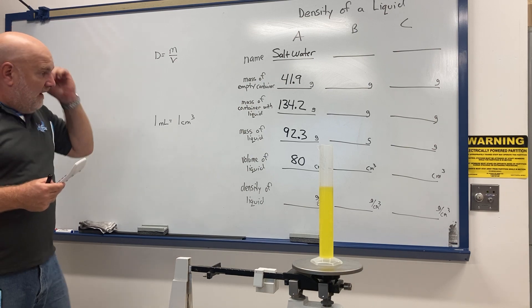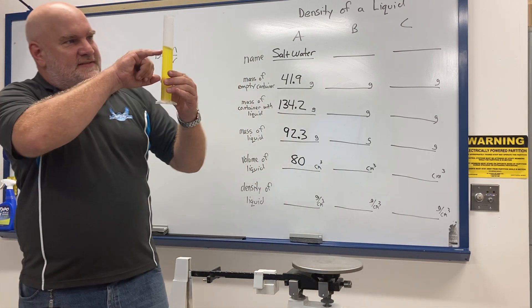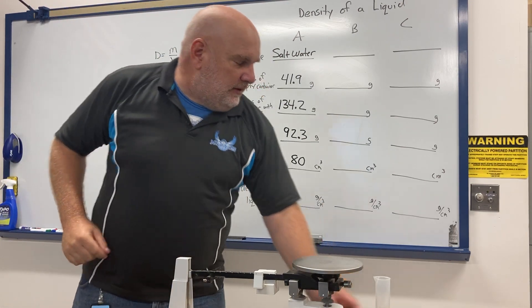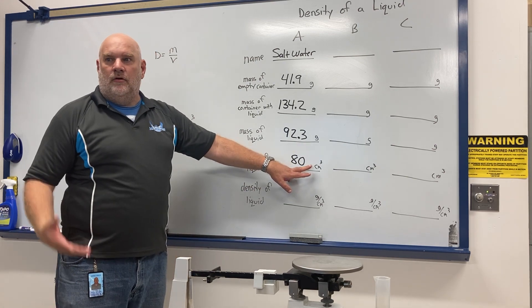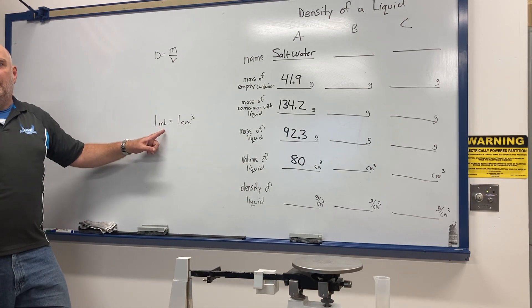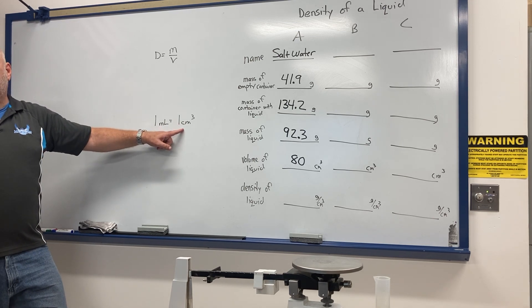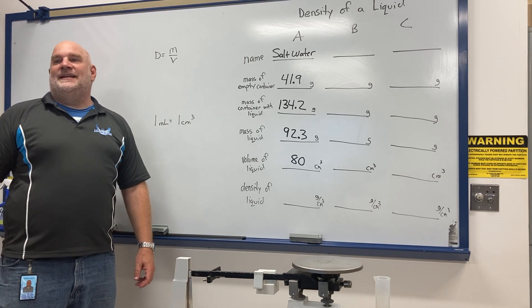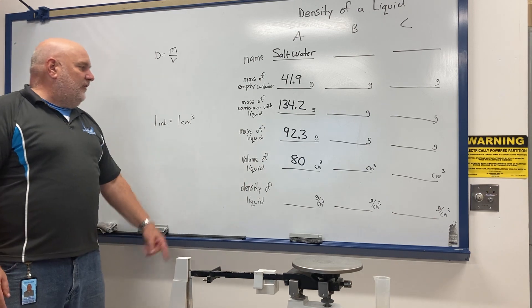The volume of the liquid I can read right off the side of the graduated cylinder — about 80 milliliters. Now, one says milliliters and the other says cubic centimeters. A milliliter and a cubic centimeter are exactly the same amount of space. Milliliters are typically used for liquids and cubic centimeters for solids, but they're interchangeable. So 80 milliliters is also 80 cubic centimeters.